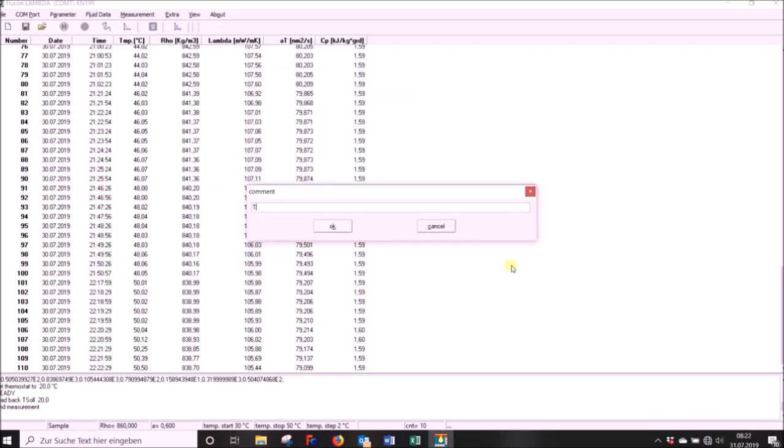After clicking on Save, you can add a comment which may include further information on your sample or measurement. Congratulations! Your measurement has been saved and you can now close the program or start another measurement.